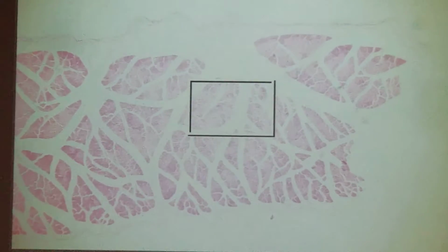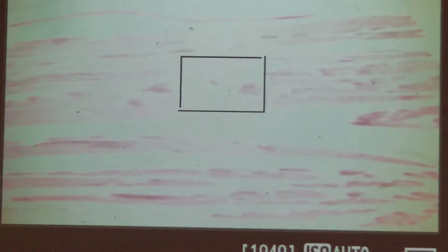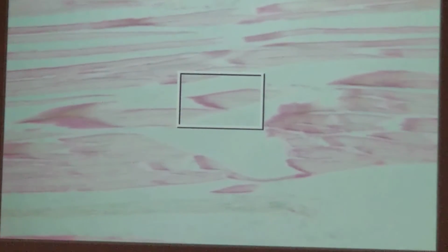So we're going to have to go up on the slide. Before you go up there, there is where it's running long ways, right? That's a longitudinal section, is what it's called. When you look at that, you can tell that's skeletal muscle, right? No, I'm just kidding, I can't. But if you go to 10 and focus at 10, you'll find one of these where we've got some strands all running in the same direction.